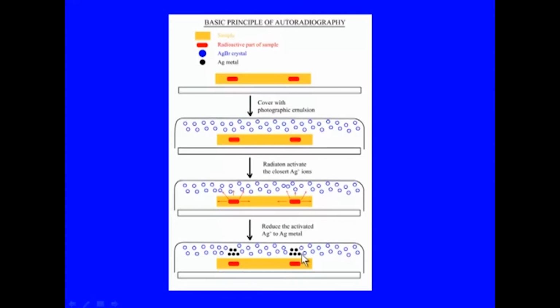So, what you see here is how, from exposure to blackening or development of the film, the image occurs. Now, one is called the emitter, which is this, and the emulsion, which is this. So, the emitter to emulsion relationship is very crucial.